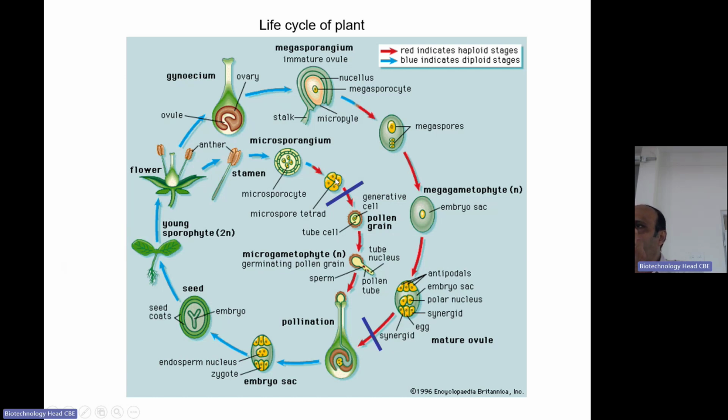If you remember, the pollen has the exine and intine, a very hard pollen wall, which cannot germinate onto the medium. So before that pollen wall forms, we need to select a stage which can germinate or produce cells in the normal medium.